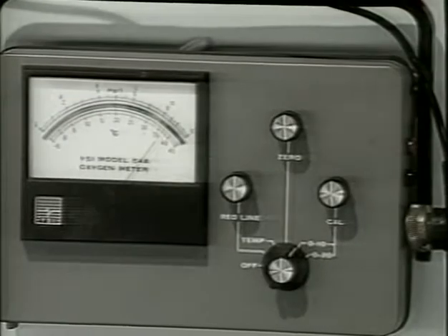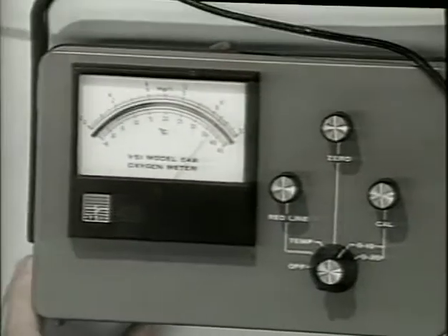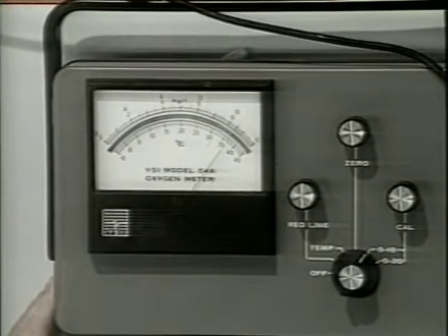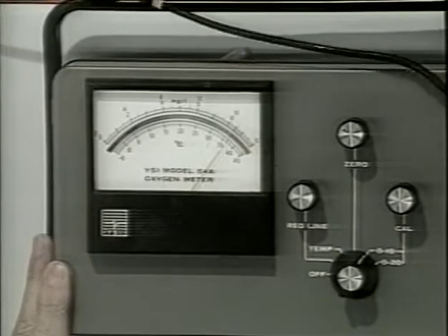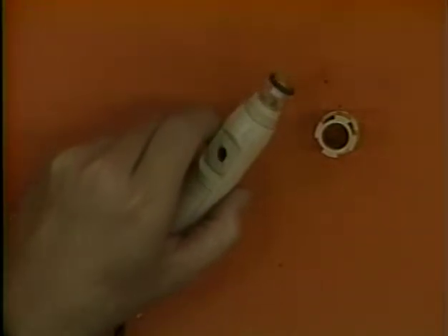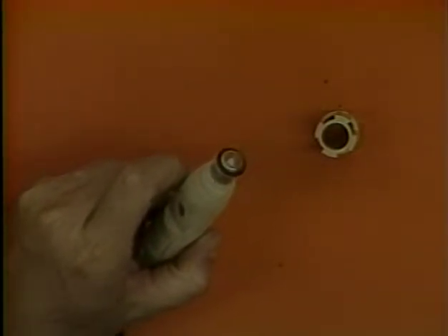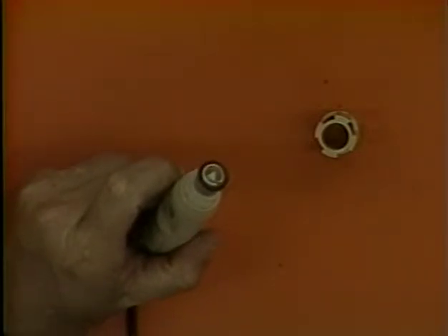If properly used and cared for, your oxygen meter may be used for many years with little maintenance. Besides changing and recharging the batteries, the only part of the instrument that requires periodic care is the probe. The oxygen probe is covered by a thin membrane which should be replaced every 2 months or so, or when air bubbles are present below the membrane. To change the membrane, proceed as follows.